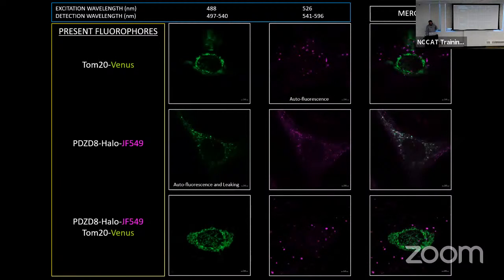All right, so now we're going to switch to Zeiss. This slide is about autofluorescence, which is something that people have talked about, but when I started doing this, I didn't know anything about it, and it was very confusing and difficult, because it's a very annoying byproduct of doing cryogenic fluorescence microscopy. At cryogenic temperatures, the decay time for autofluorescence is longer, so it ends up as a signal in your image. And you have it in all the channels.